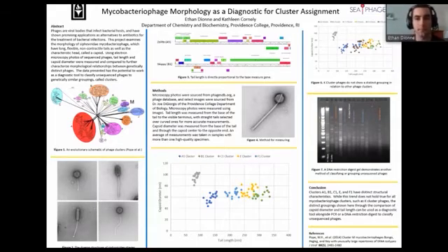So the K cluster phages didn't really land nicely in any of the groupings that I found with some of the other clusters. Unfortunately, the data isn't that clear cut, where we can just say, oh, all phages land into these nice groupings, and we can use this as a pretty standard way to classify phages that are unsequenced into these clusters, because the K cluster phages don't share this kind of trend.